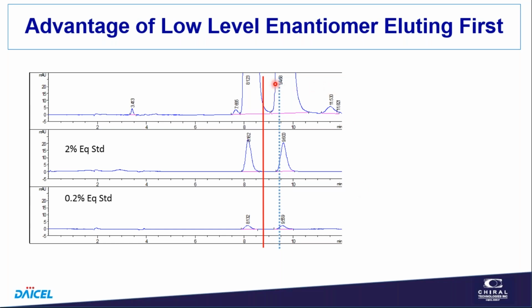But if we look at how much the front peak bleeds into the tailing peak, we see, well, that's not so much. In fact, you can see that these peaks probably have no bleed of the later eluting peak fronting into the second peak. So in general, we would want to have our low-level enantiomer elute first if we can. Two advantages: one, the first peak is usually taller, and the other is there's less interference from the later eluting peak. Can't always do that, but at least you need to be aware that you can have some tailing of the first peak into the second peak.